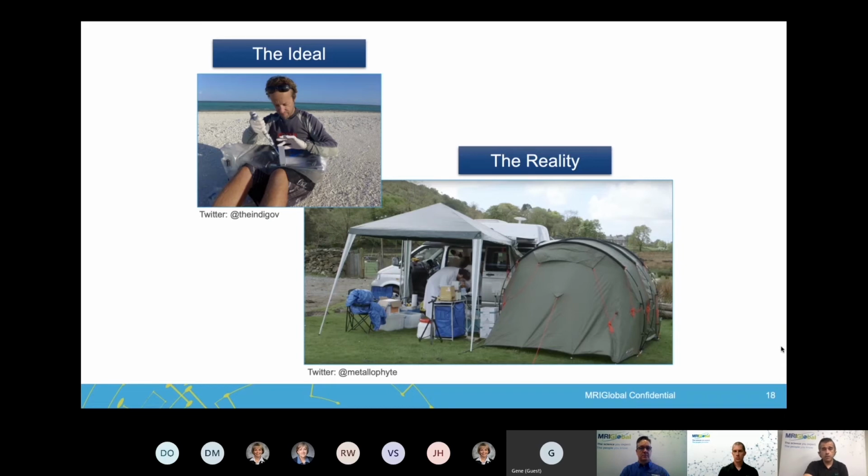But there's a strain of it called Everglades virus that's circulating down in the Everglades. And we went down there with a team of entomologists looking through mosquitoes for it. We ended up finding it, but we had meant to do it in the field, so we brought a Biomeme and PCR primers and a MinION and all the things that we would need in a backpack.